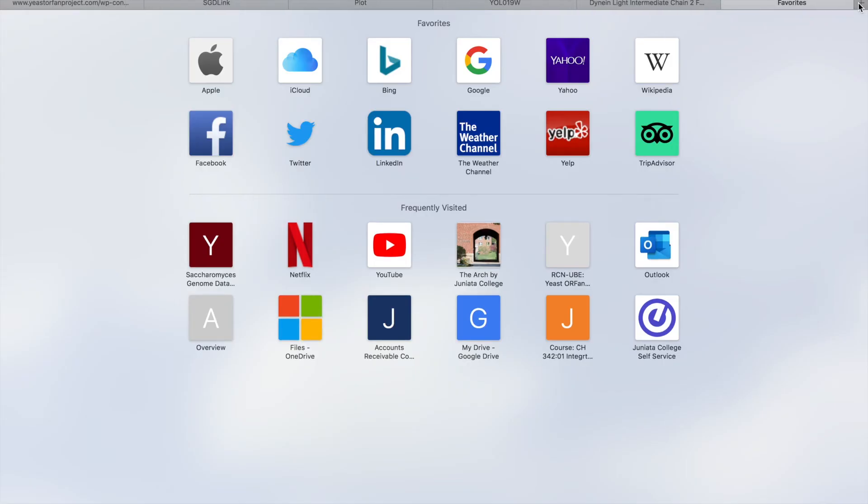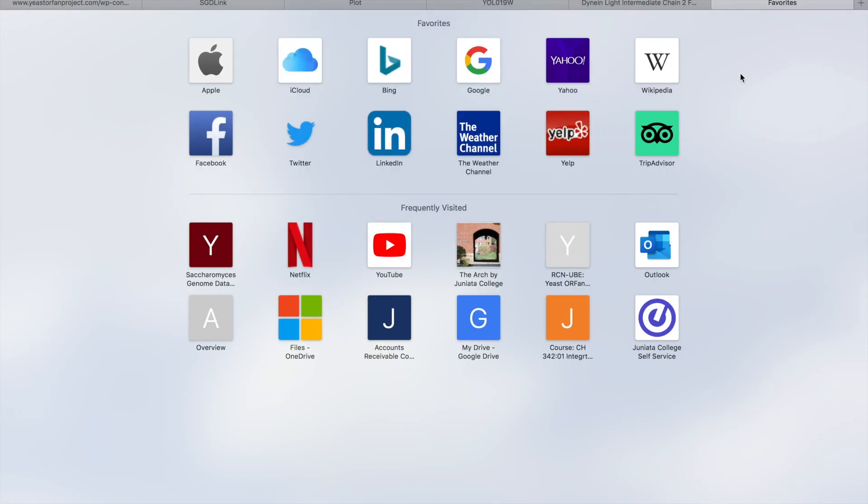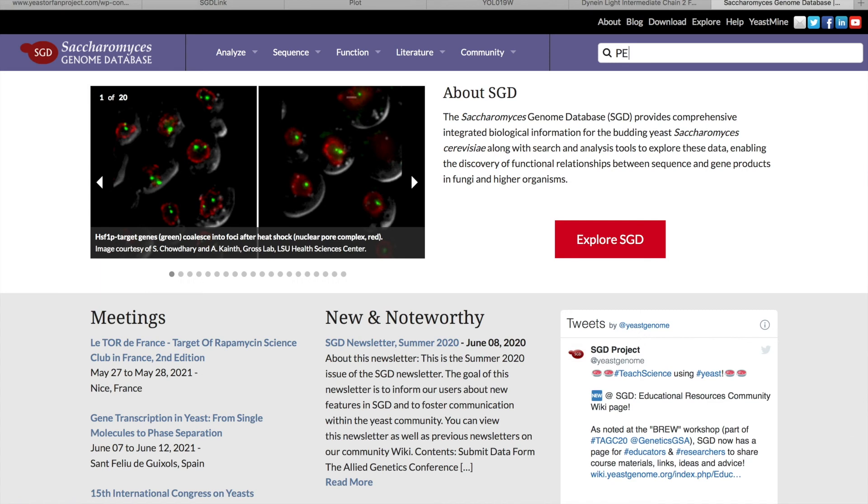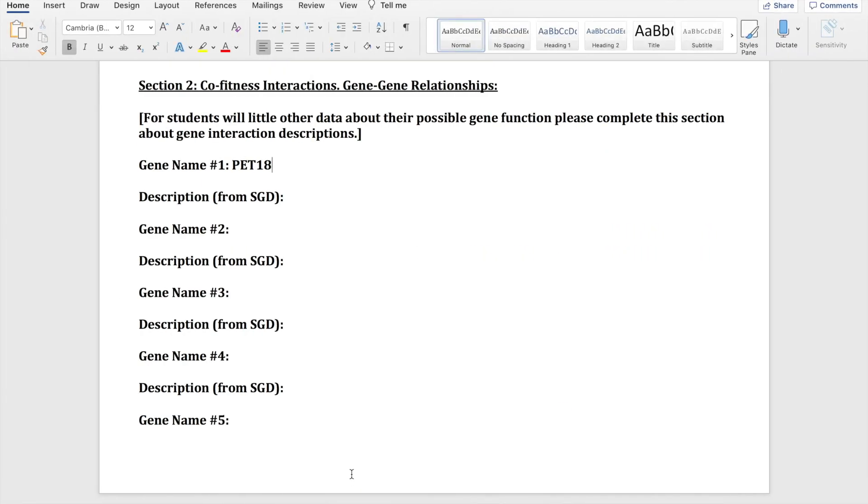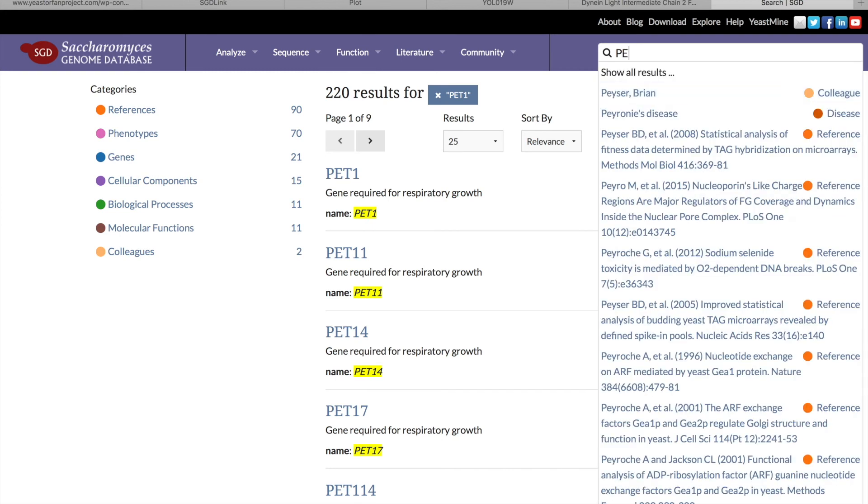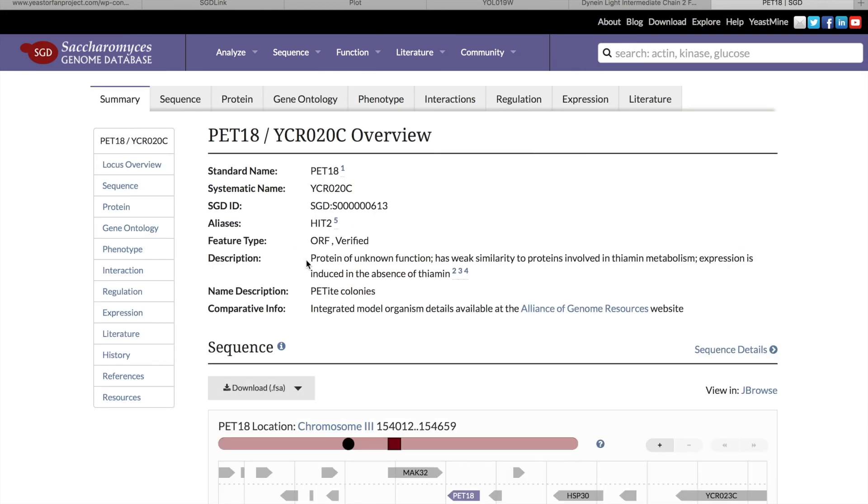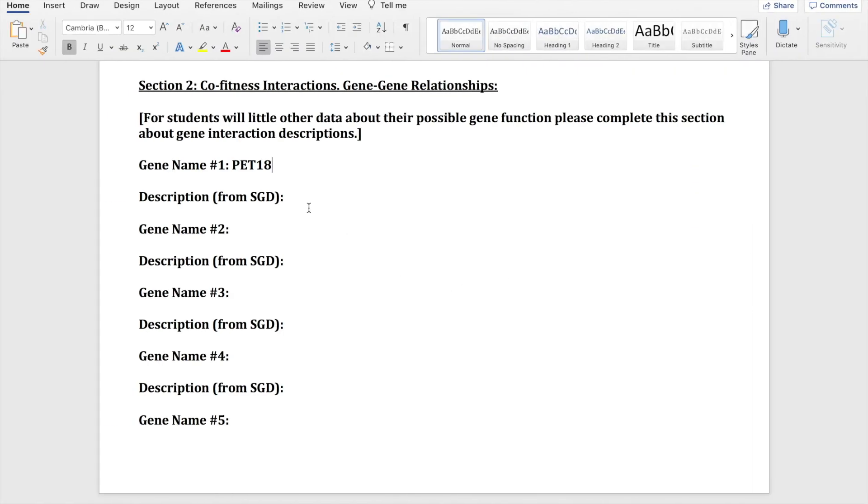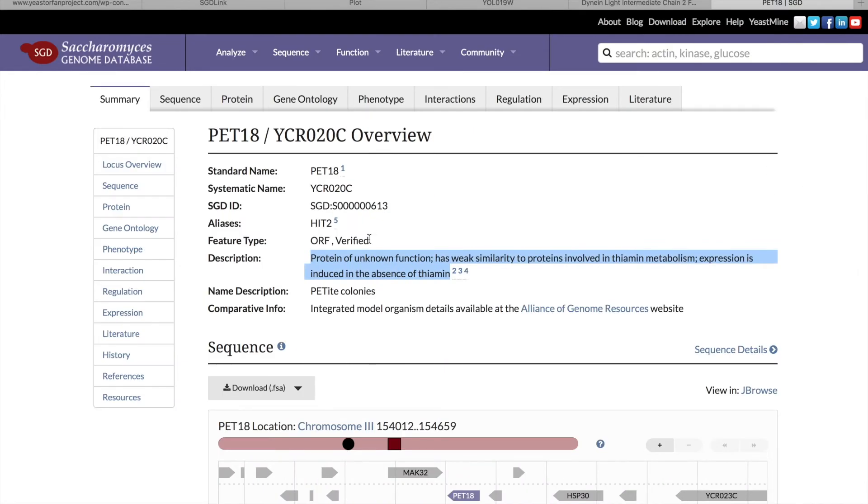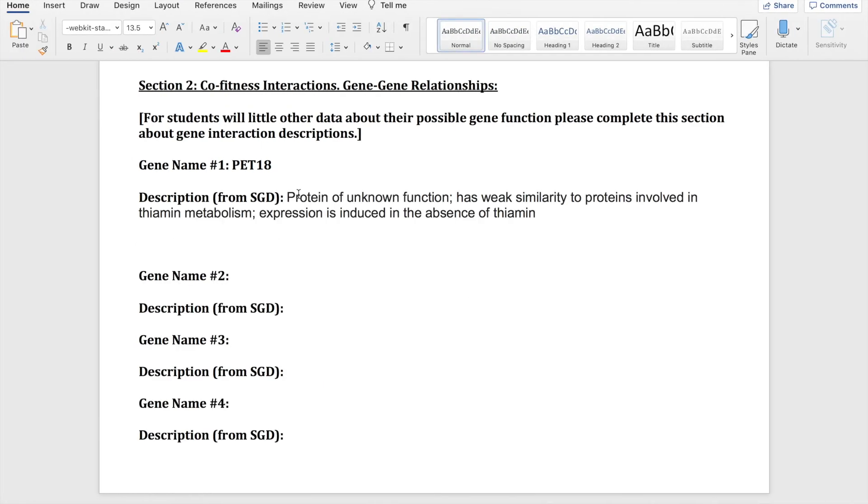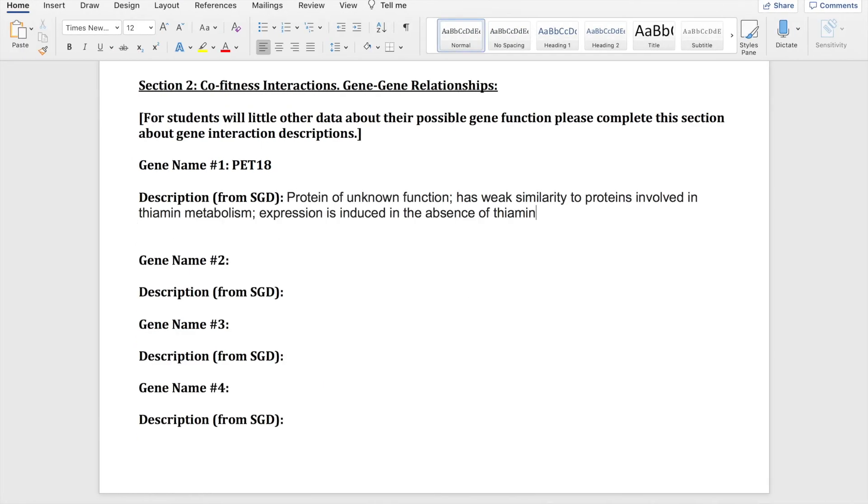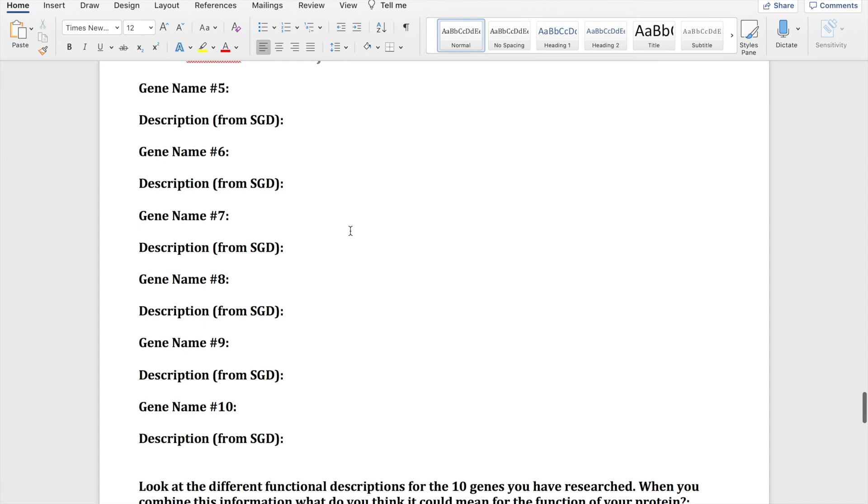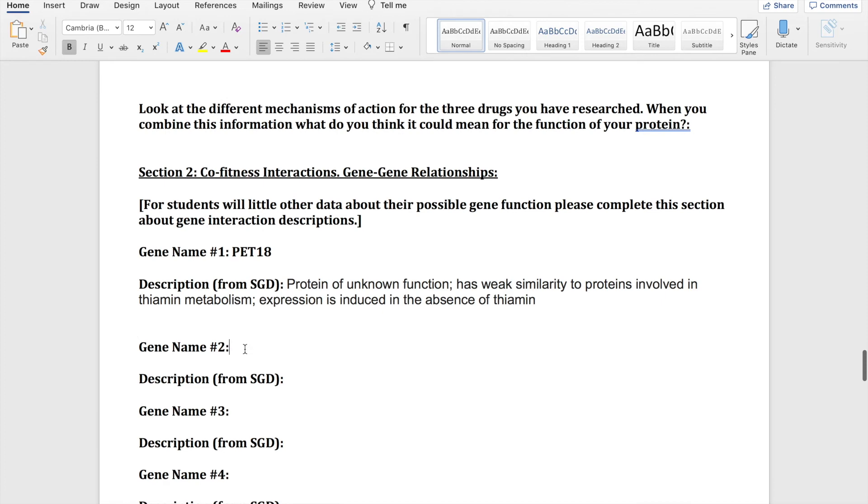And then you're going to go to the SGD and search it in the search bar. And then you're going to copy and paste the description. And the yeast that I'm using is not a known gene. It's a gene of unknown function, so it's likely that a lot of the genes that come up with this might not have a known function.